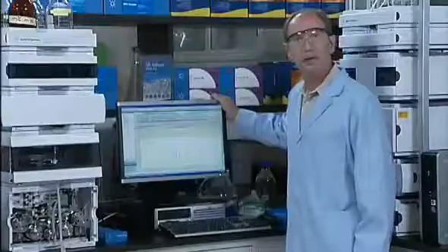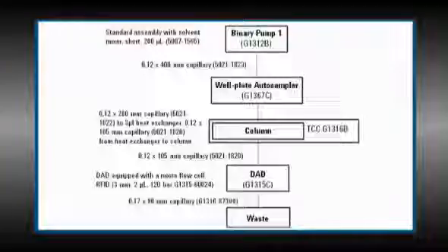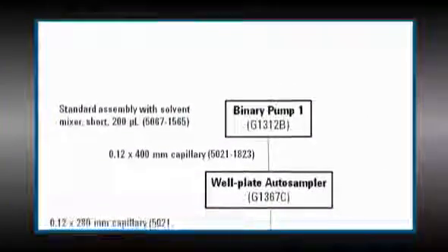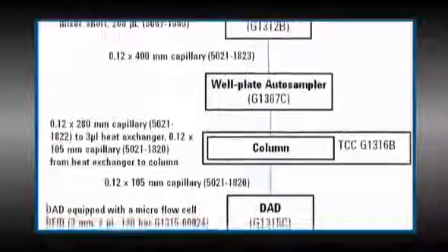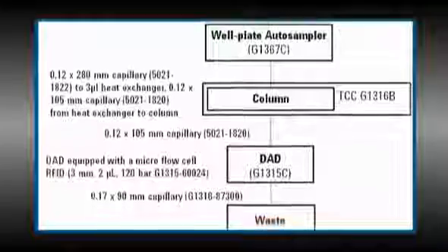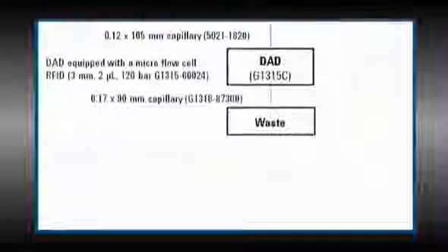All of these components can develop problems and require troubleshooting. It's a good idea to have a system map from when your system was working correctly or when it was first installed. Basically, you should sketch the setup and record where your connections are, how the electrical connections were made, your hydraulic or liquid connections, and even how your modules are stacked. Understanding what is normal is one of the key things you need to know in order to identify what is not normal. Having this system map will help you do this.